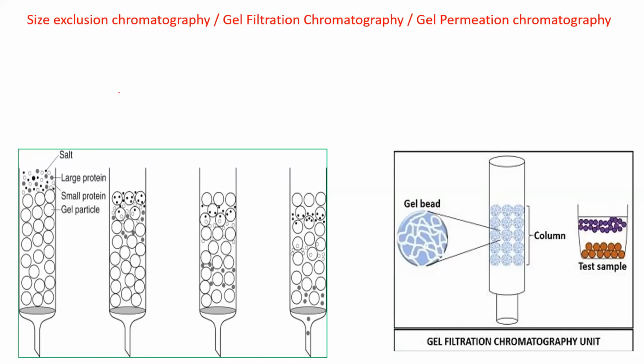So chromatography, again, what are we doing here? We are actually working on separating. So again, emphasizing that it's a separation technique, and out of many biomolecules, one biomolecule or one compound, a specific drug, a specific metabolite, a protein.